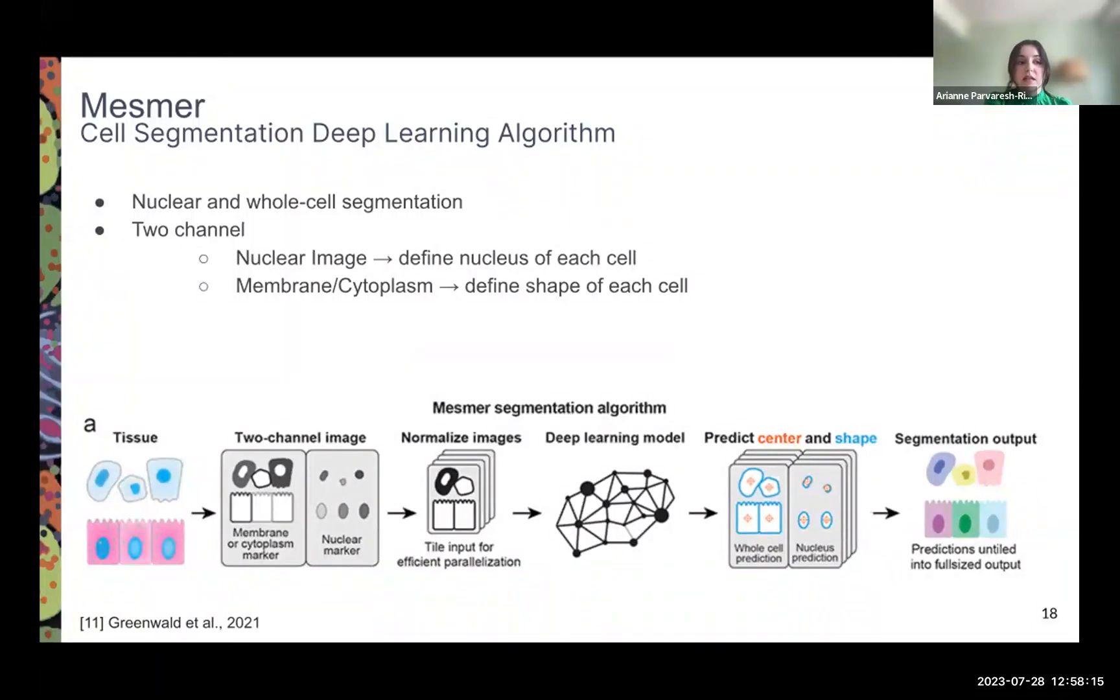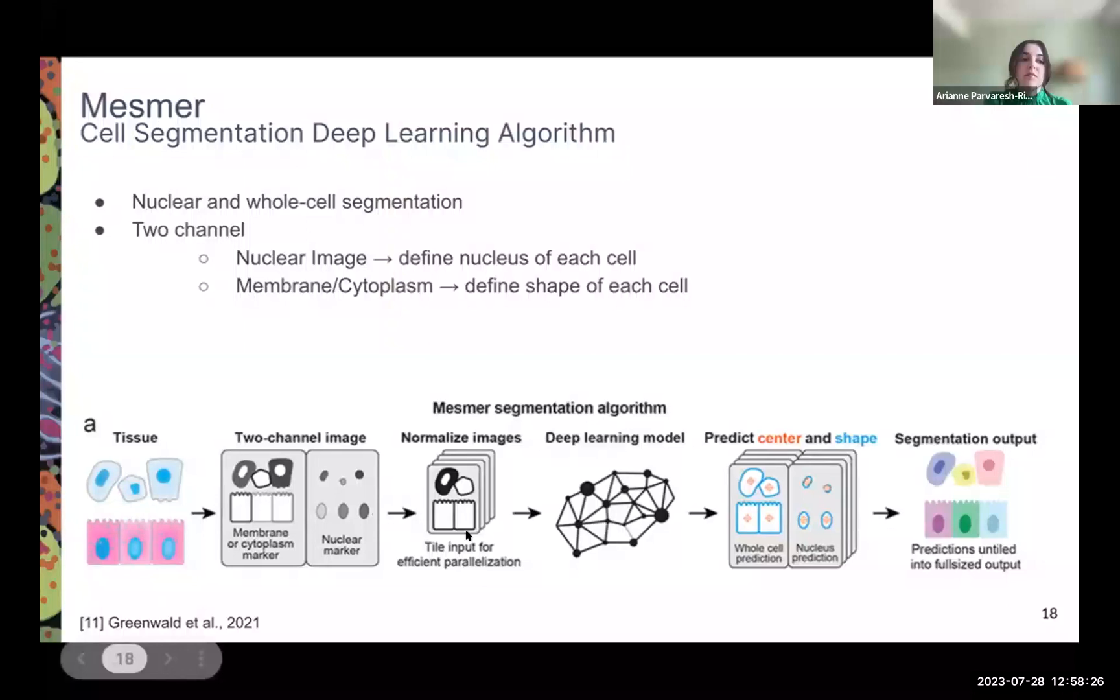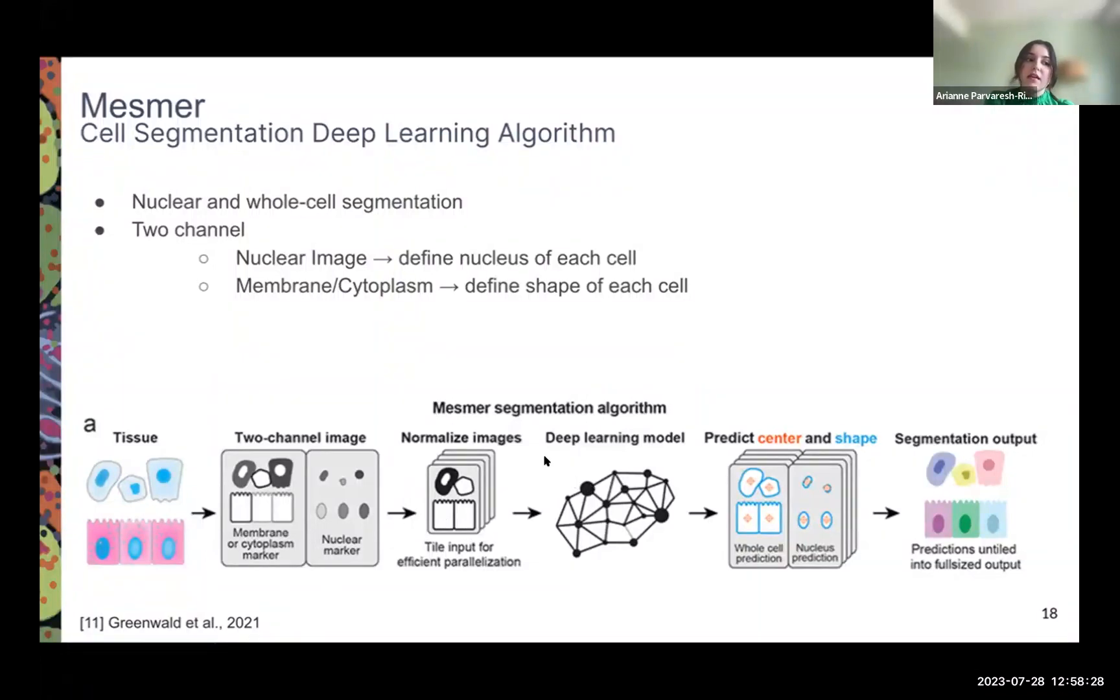The nuclear image defines the nucleus of each cell, and the membrane and cytoplasm channel defines the shape of each cell. Once a tissue sample is gathered, the two channels are identified, being the nuclear channel and the membrane channel. The images are then normalized, they run through a pre-trained deep learning model. The model predicts the center and shape of each cell, and then performs segmentation.